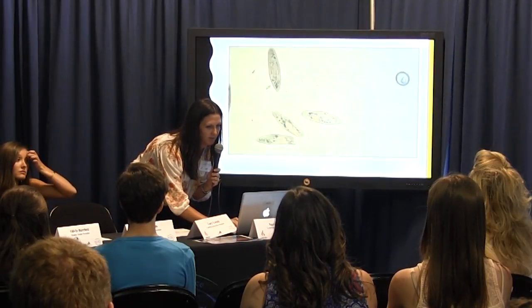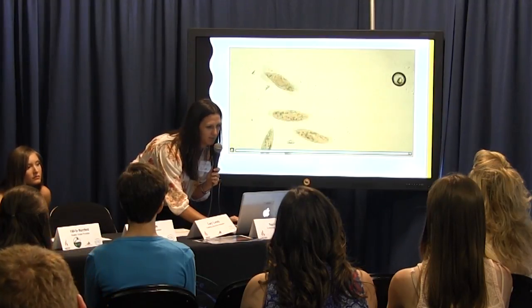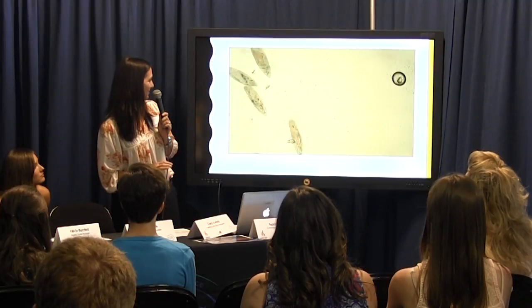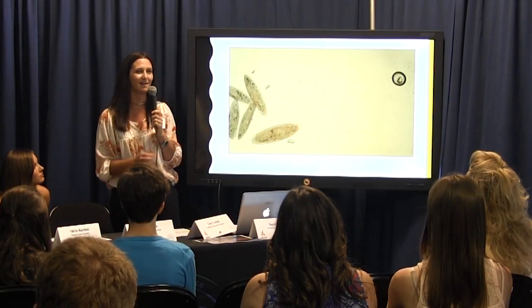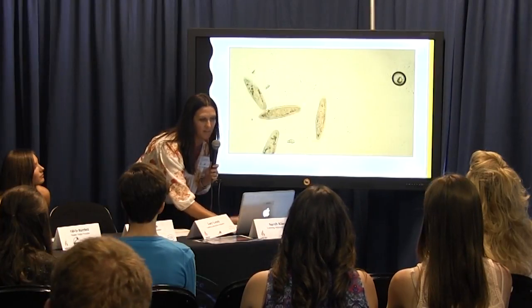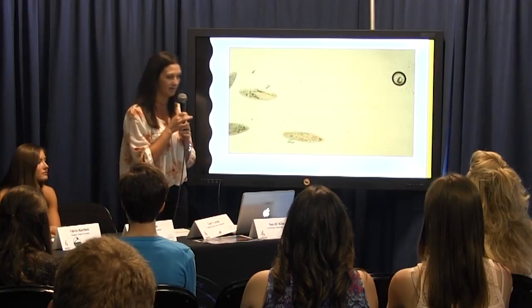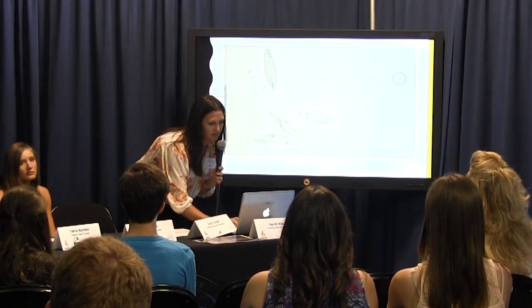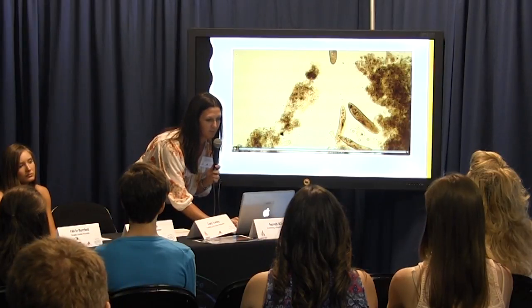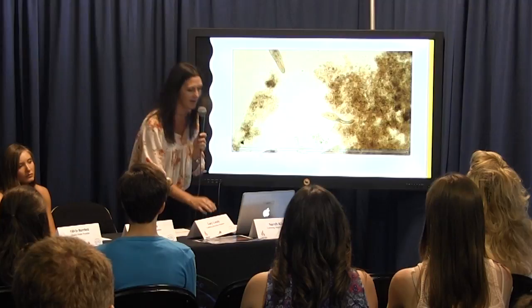Here's some more live footage. If I can get that to come up. This one's really good. Some paramecium there. That's pretty cool. When they caught living organisms, they got really excited about that. But this is just what you can see with the equipment. So I'm just going to show you all a few more. Kids were really proud of these. So that was very similar to the last one.